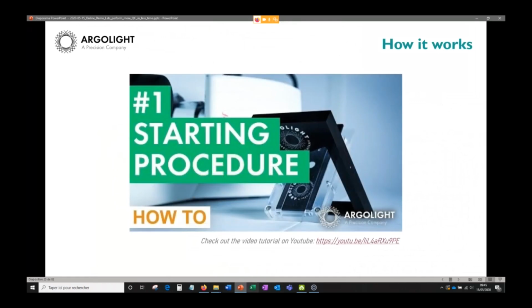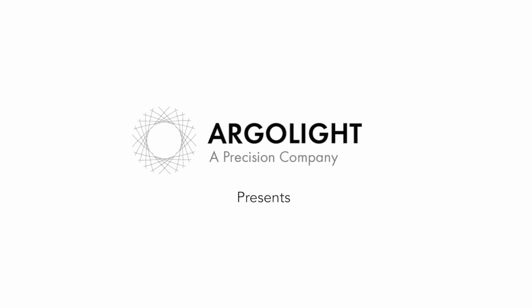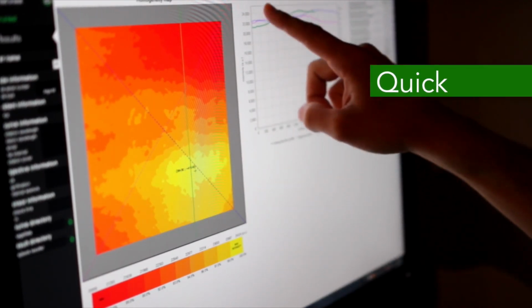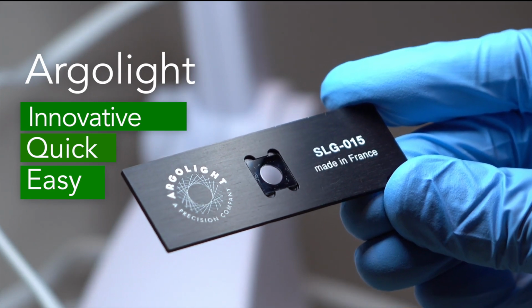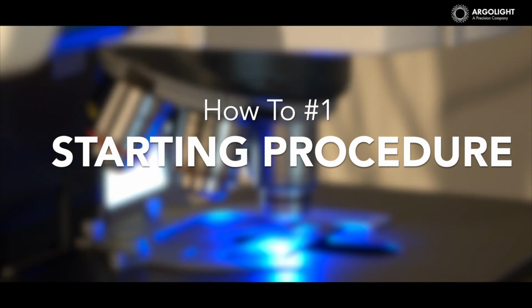I will just show you a video because I don't have any microscope. I hope it is working fine. It lasts less than 2 minutes. It presents the process for how to acquire the patterns.